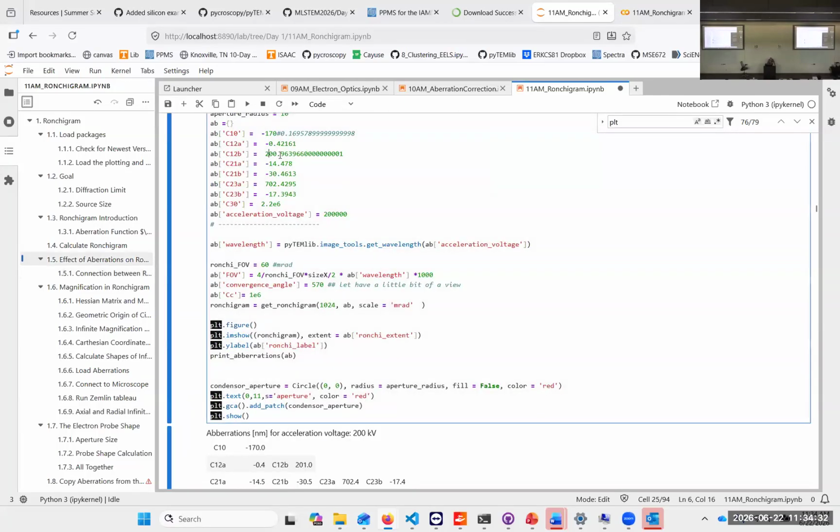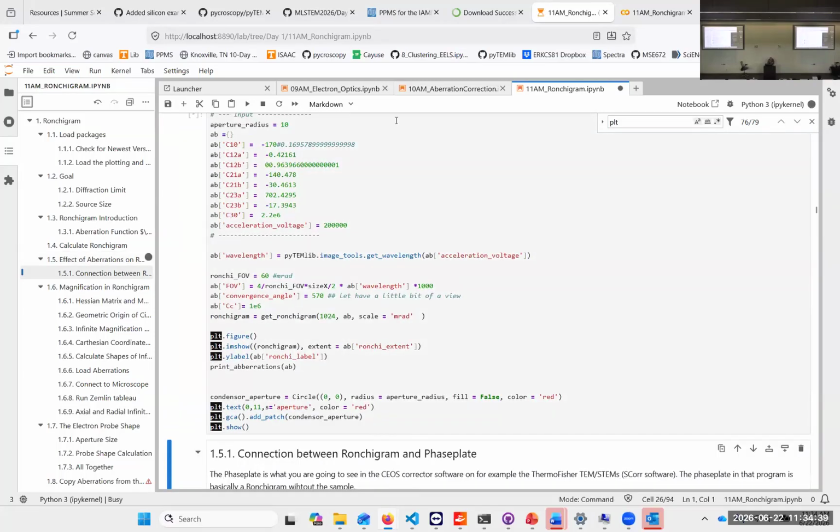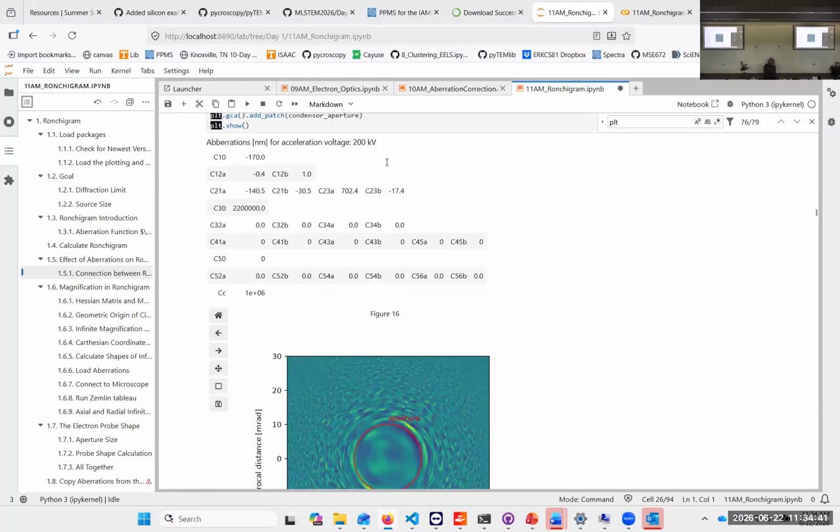Okay, so aberrations. Let's put some coma in. Maybe it's not enough.